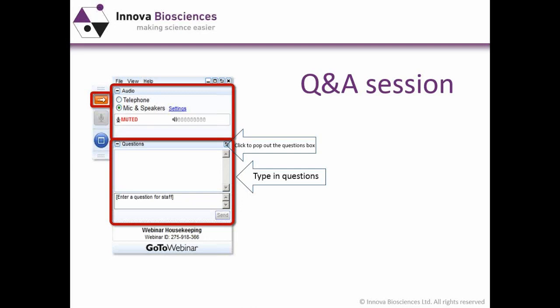Our first question today is, can you coat any gold nanoparticle? All the particles that we have tested so far, yes. That's 40 nanometer size from all of the well-known suppliers. We've also coated particles successfully from 10 nanometer to 80 nanometer in size.